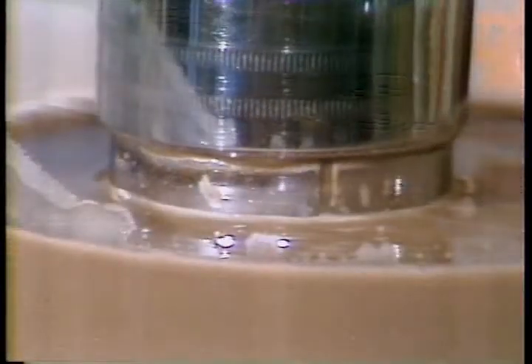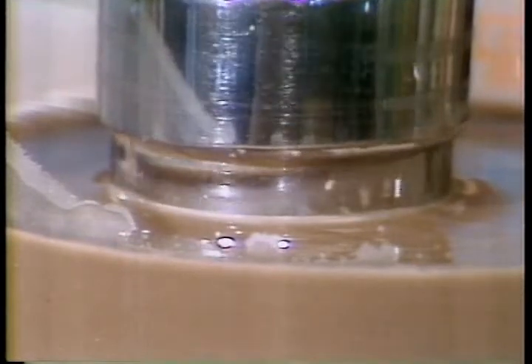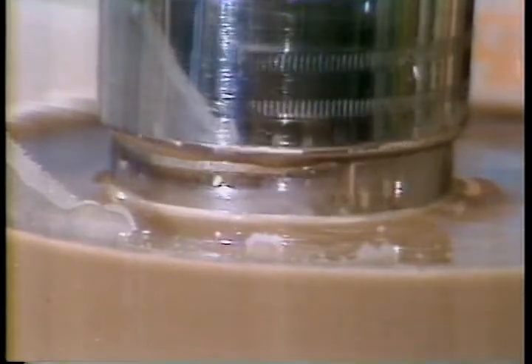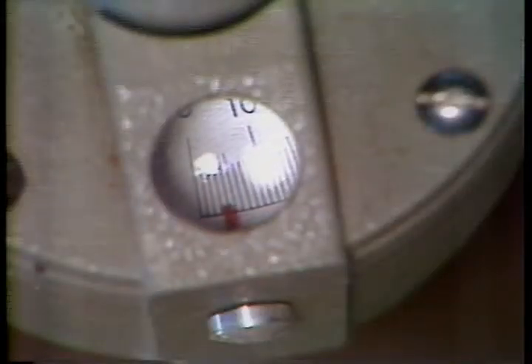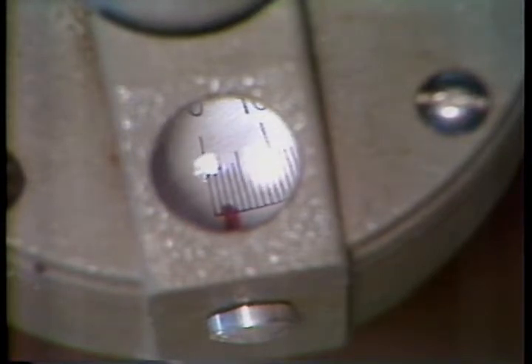The engineer will rotate the meter very slowly at about 3 RPM to see what force it takes to make the mud let loose of the inner cylinder. Watch. The needle will start to move, then fall back almost to zero. This highest reading is what he's looking for.